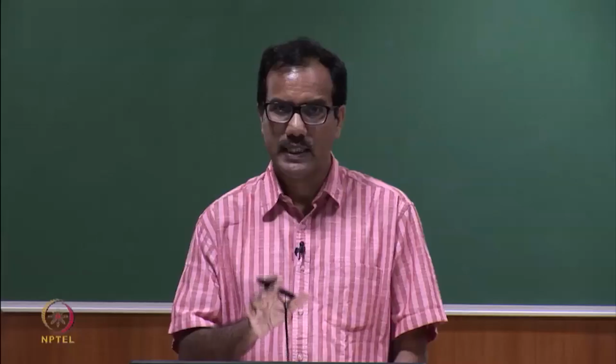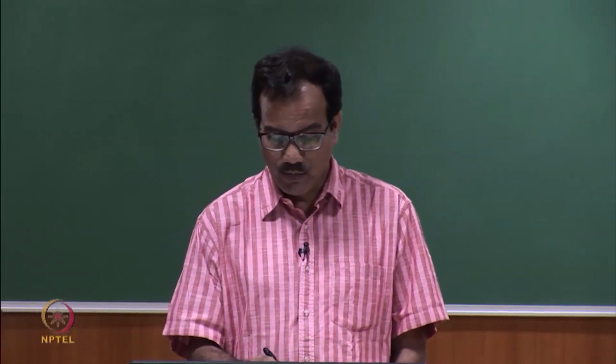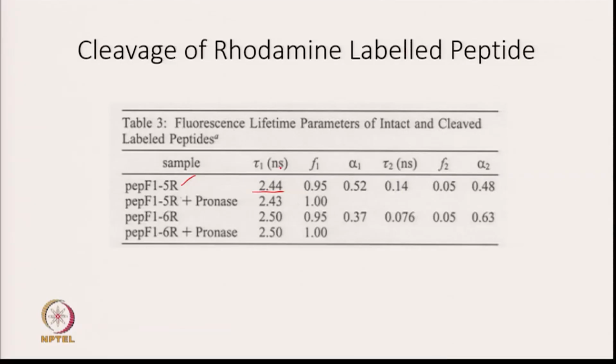Its fluorescence decay is basically bi-exponential. So, one lifetime is 2.44 nanosecond, another lifetime is 0.14 nanosecond, the fraction F1 is basically 0.95, here F2 is 0.05.